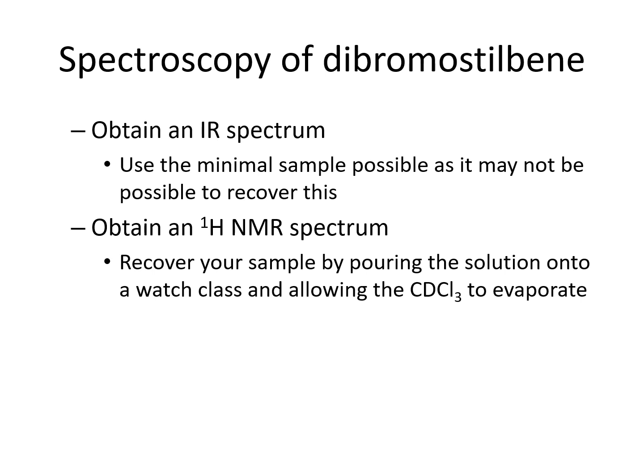In this experiment, we'll also use IR and NMR to characterize the dibromide. When using IR, try to use a very small sample because IR samples are not recoverable, especially for the IR we will be using. But we do not have that kind of problem when we use NMR. You can just get back your sample and dry the solvent off, and then you can have your sample back.